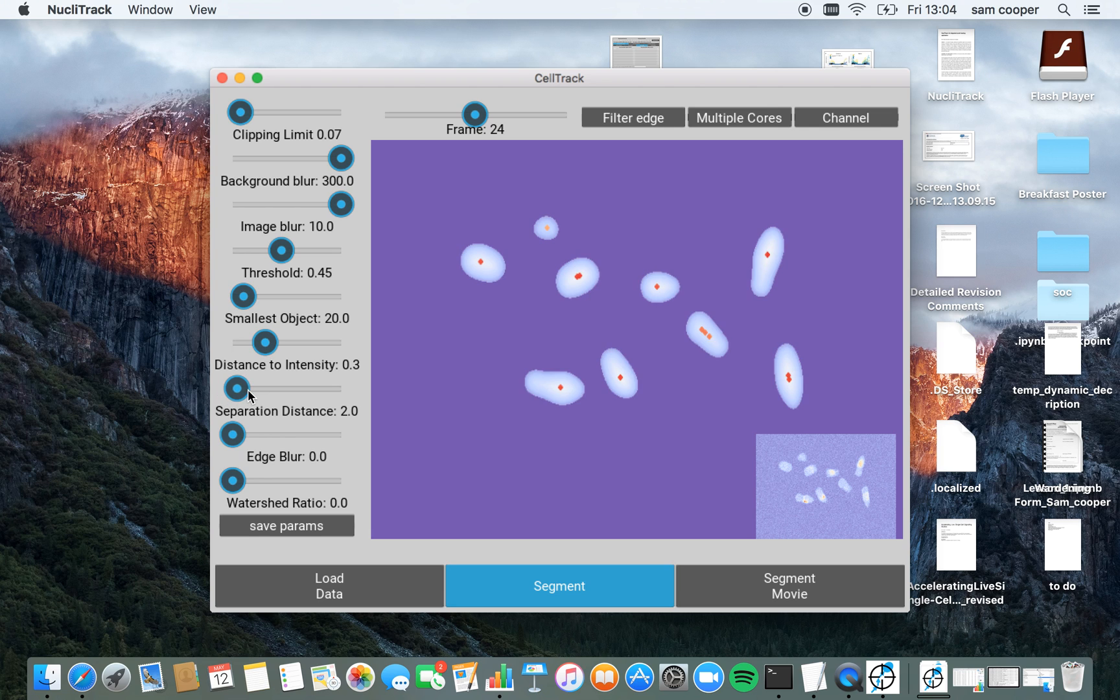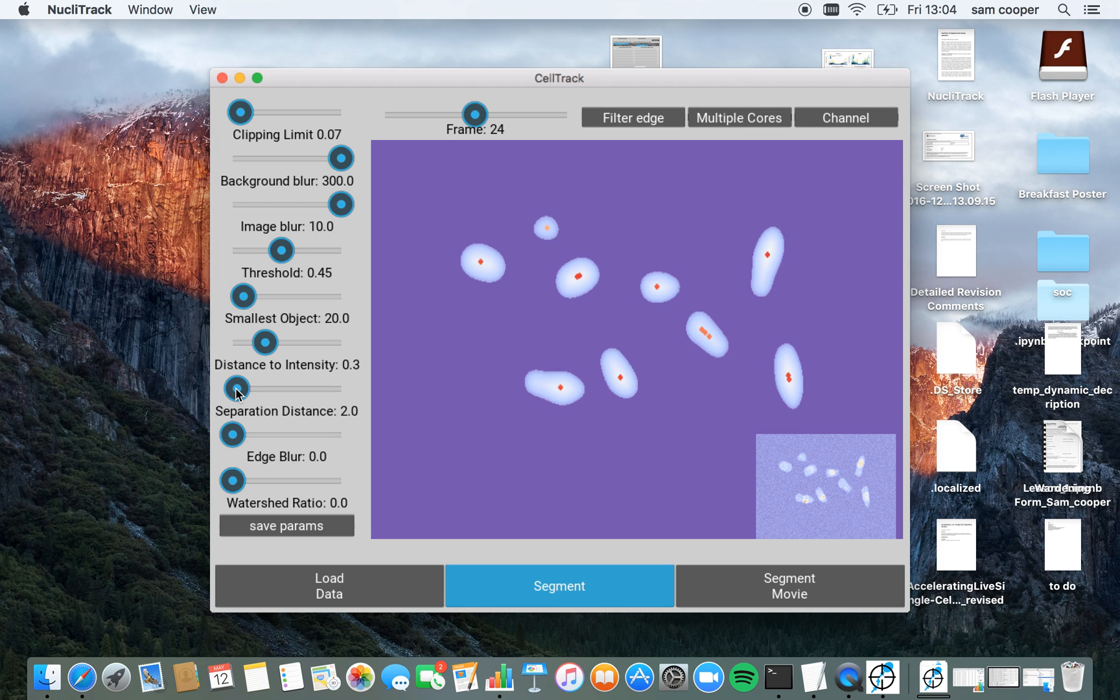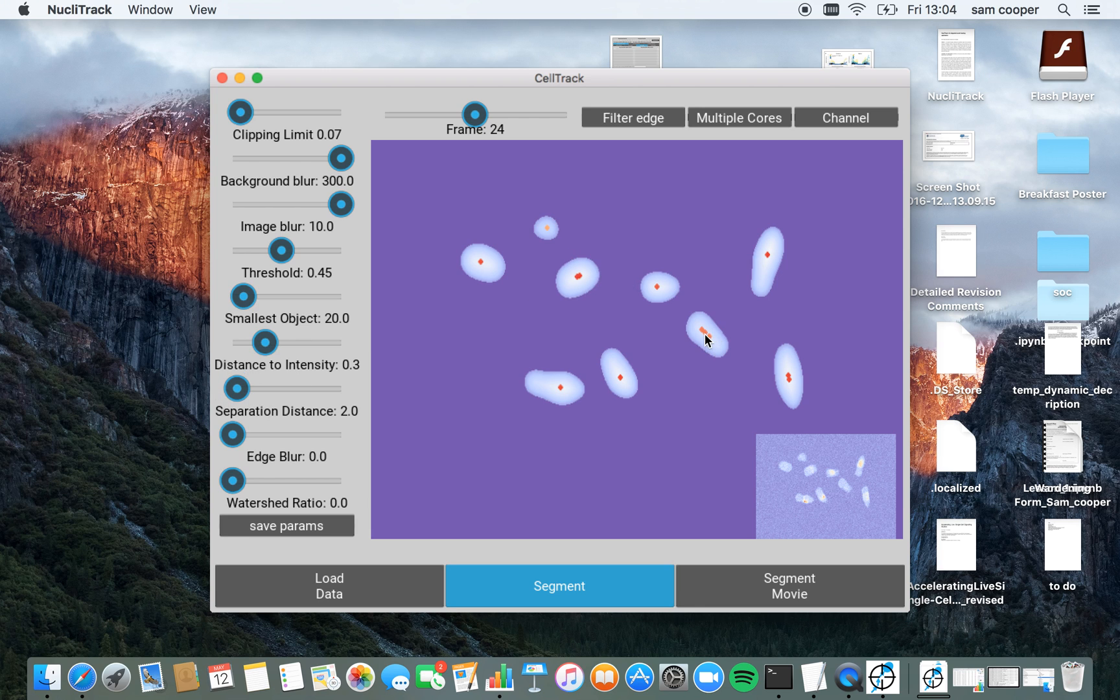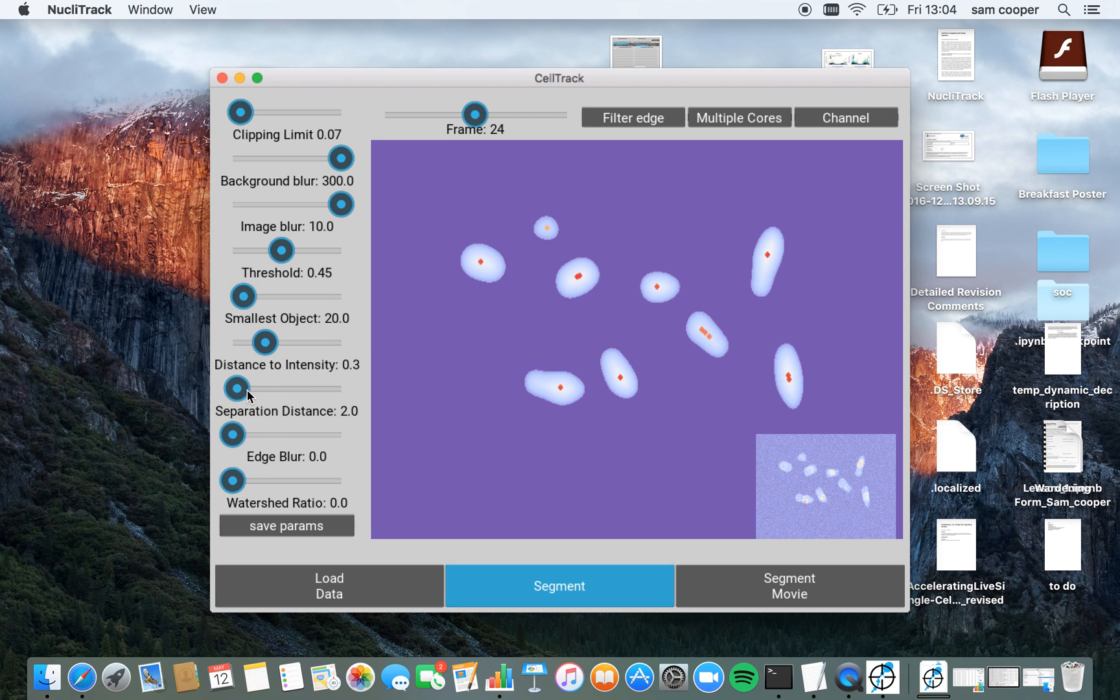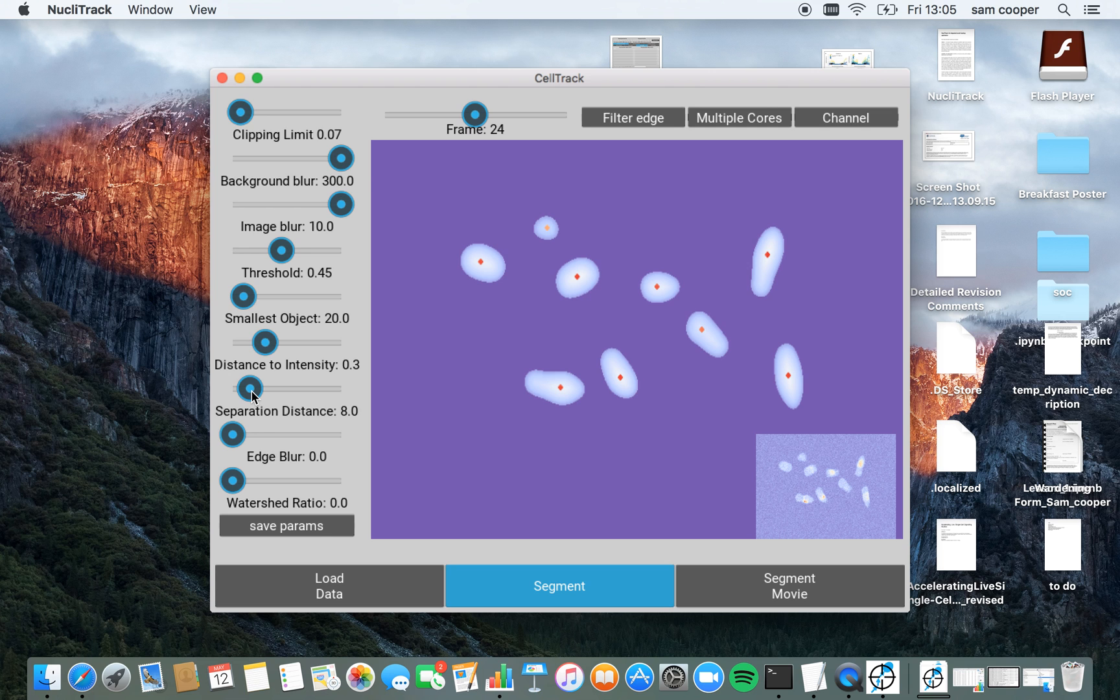Next, we have separation distance. Separation distance is important for identifying or ensuring only a single point is chosen per nuclei. Where it's only this value of two pixels here, you can see that many of the nuclei have multiple peaks of intensity inside them. By boosting this separation distance up to six, we can see that there's only one peak per nuclei now. This is what we want.